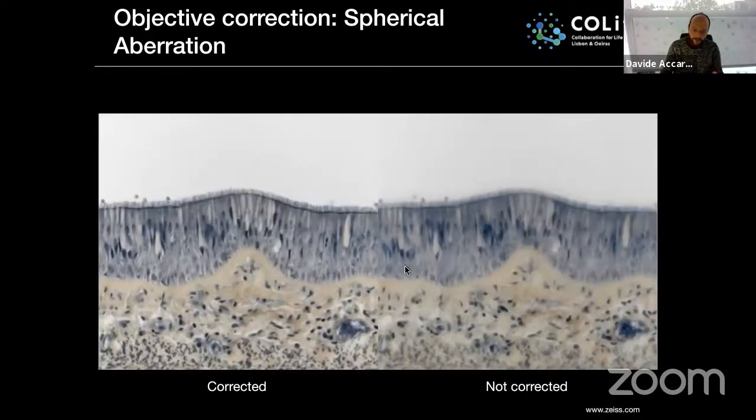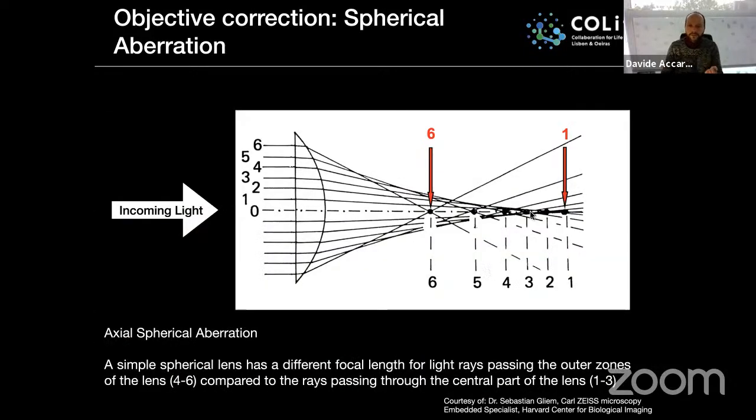So an elongated object that will not cause only distortions and incorrect representation of the object itself in your acquired data, but will also cause loss of resolution and blur in your images.